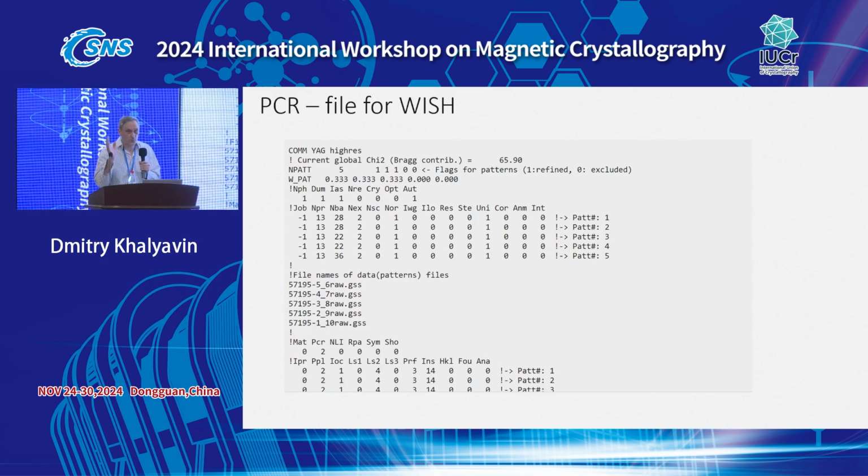So the first thing you need to decide is how many patterns you want to refine. As I said, we will have 5 of them. And probably you don't always need to refine all of them. You can refine all of them, or you can refine only one of them. It's fully up to you.